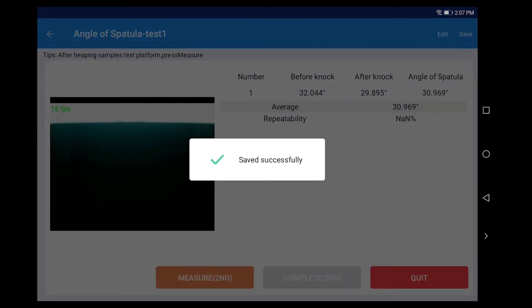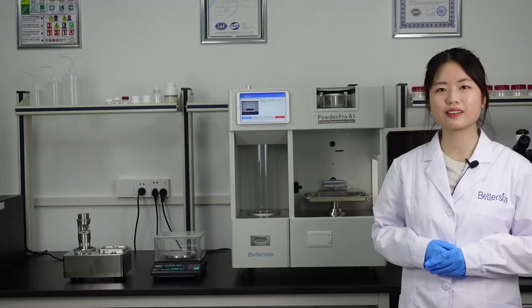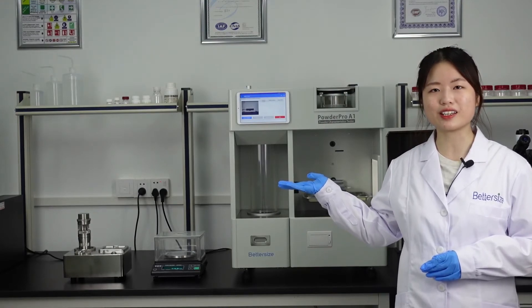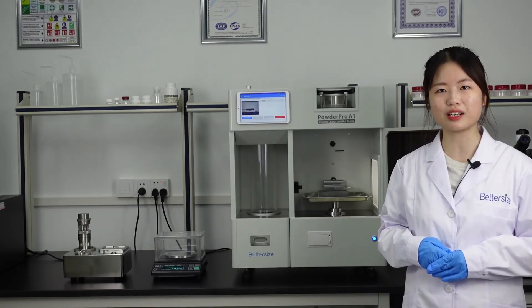Click 'Save', then click 'Quit' to complete the angle of spatula measurement. It is recommended to repeat the test 3 times to calculate the average value. The experiment illustrates the efficiency of PowderPro A1 in measuring the angle of spatula, providing a reliable and straightforward method to analyze the properties of powder materials.